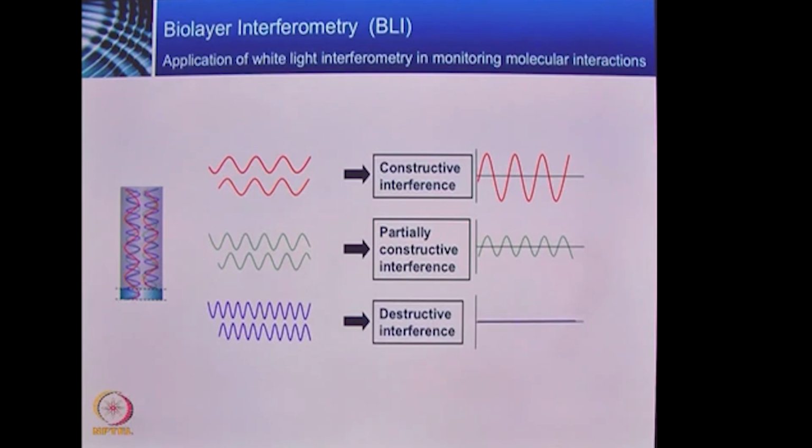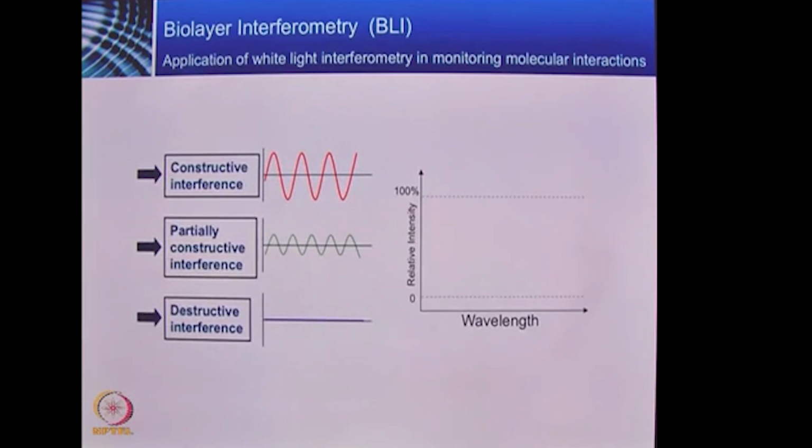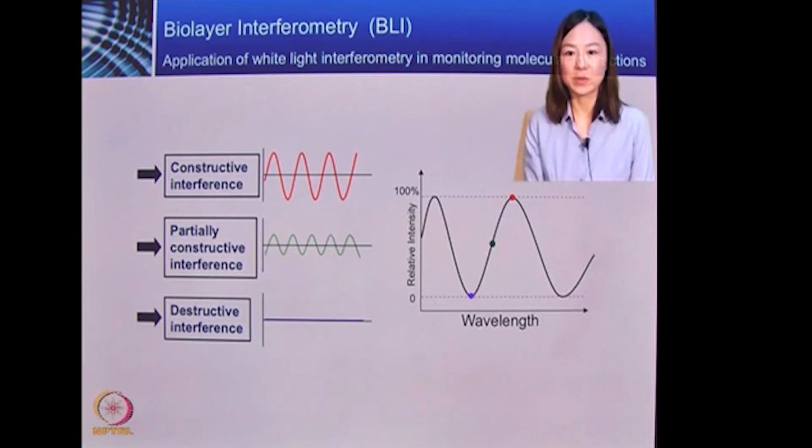No matter what, the system will monitor the two reflected beams and plot the composite of the two wavelengths on an XY plot. By plotting the wave pattern of these different waves, we can get an original wave pattern.